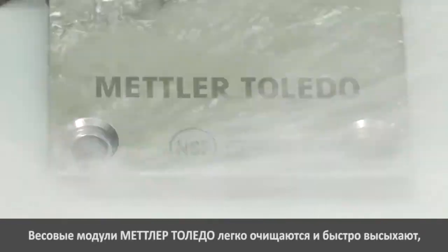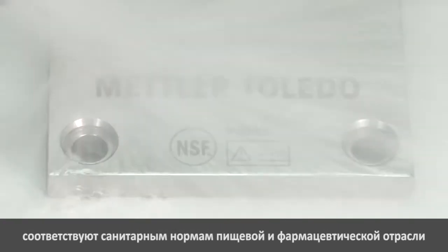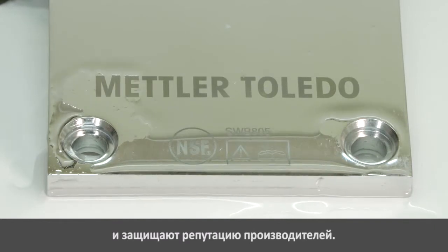Mettler Toledo's easy-clean, fast-drying whey modules help you meet stringent food and pharmaceutical regulations while protecting your company's reputation.